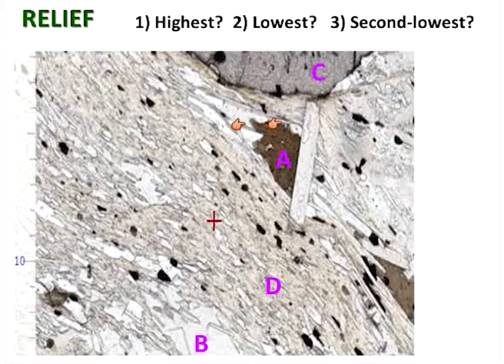If you've got an edge of a crystal which is cutting at 90 degrees straight down into the thin section, then it's very clear. So I suspect that this muscovite here, for example, the edges of that are probably cutting almost straight down into the thin section, so they're very, very clearly defined. So that's one reason for a blurred edge.